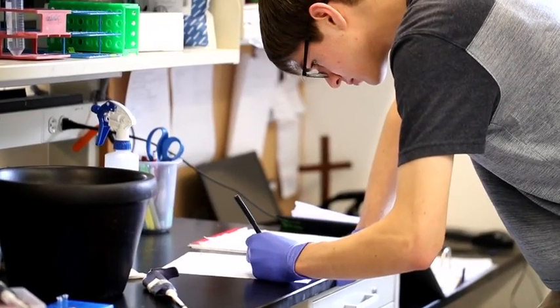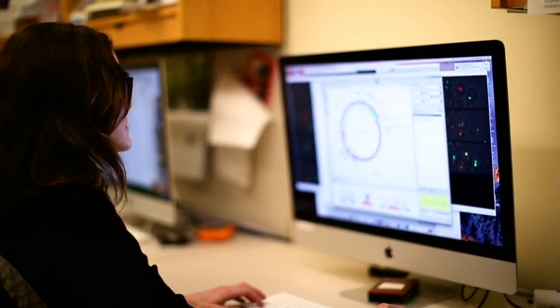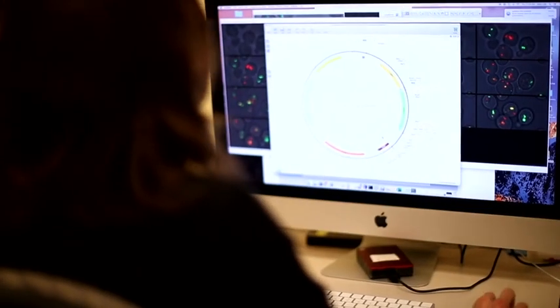The first problem is planning a procedure. Every DNA cloning experiment is different, and you need to map out all of the steps you're going to do to get you to the end. So SnapGene is set up to guide you through that workflow.